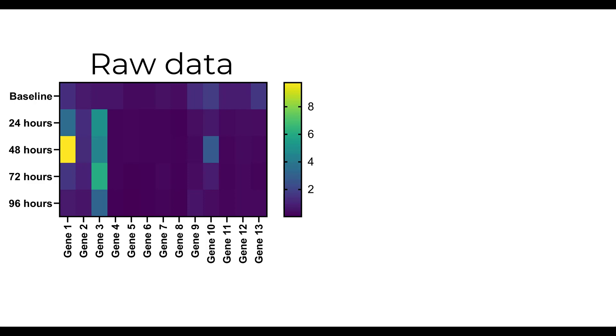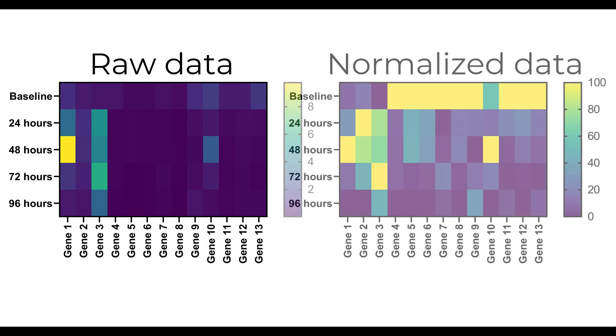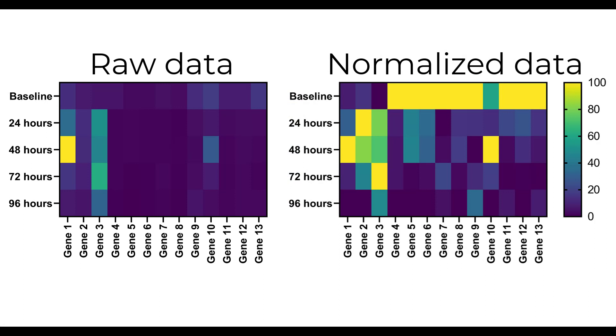It would make much more sense, for this example, to firstly normalise the gene expression data for each gene separately and re-plot this as a heat map. A heat map containing the normalised data can now be seen.